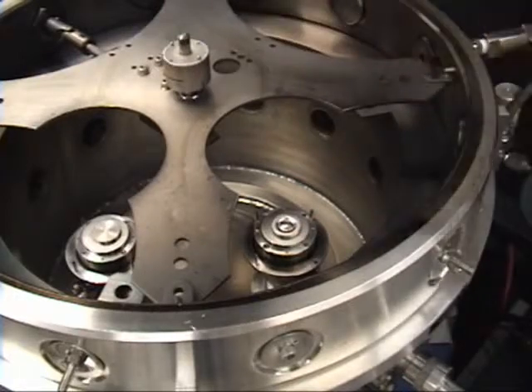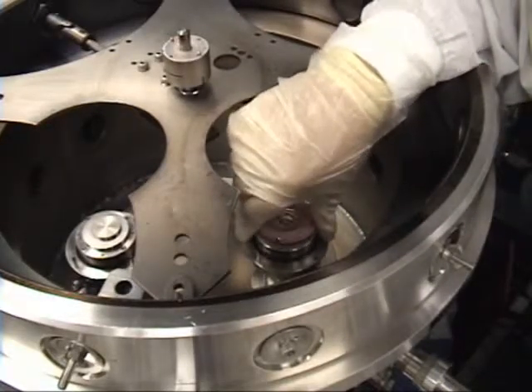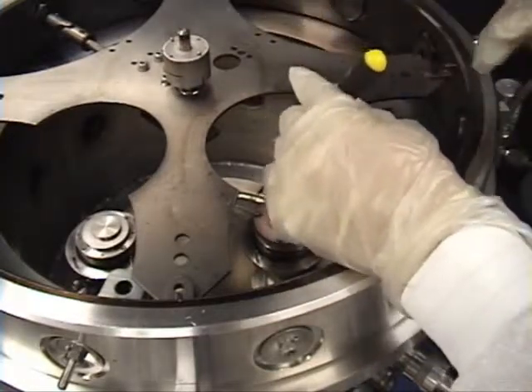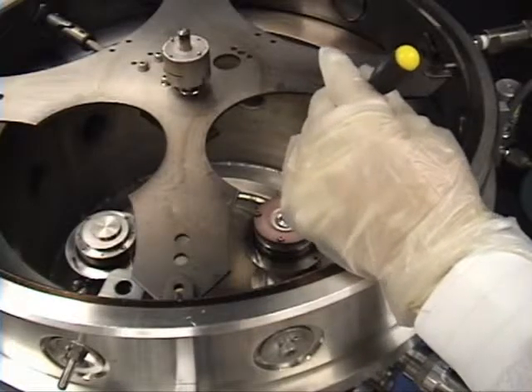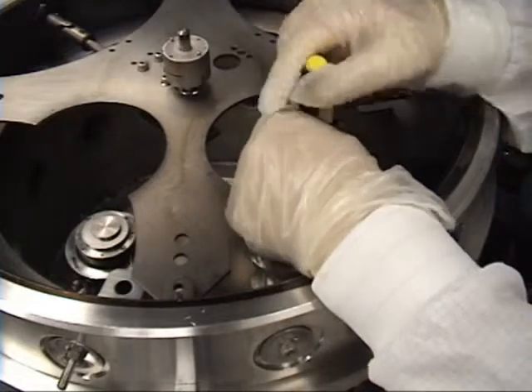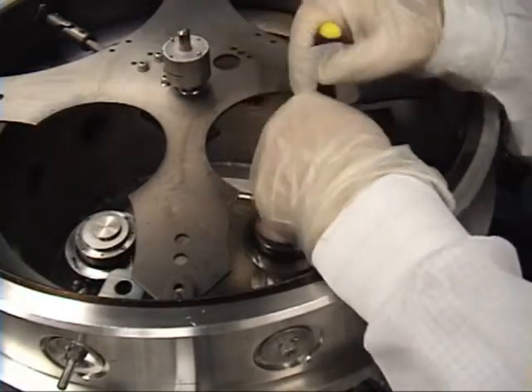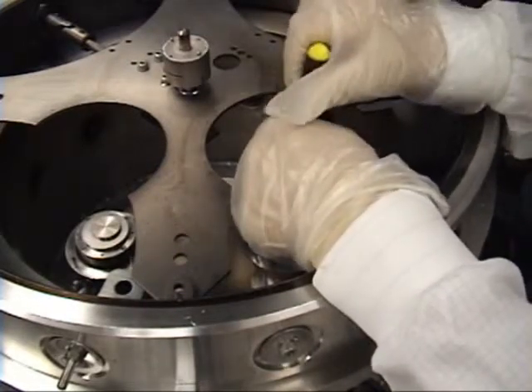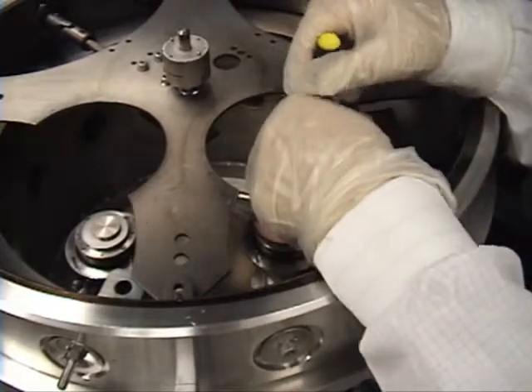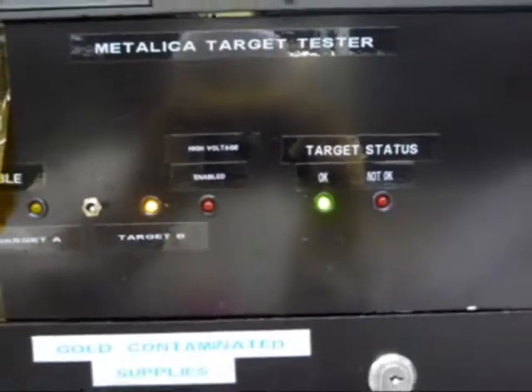Once you've done that, we're going to attach the cathode. You're going to place the screws into the holes. Once it sits freely, we're going to screw down your screws. What you're going to have to do is move your toggle to A on your status drawer, and then you're going to tighten — alternate. Never take one screw all the way down; alternate to the next screw. Alternating until you get to the bottom — have your screws snug, not tight. Once you're done, check your status box to make sure that the LED is green.